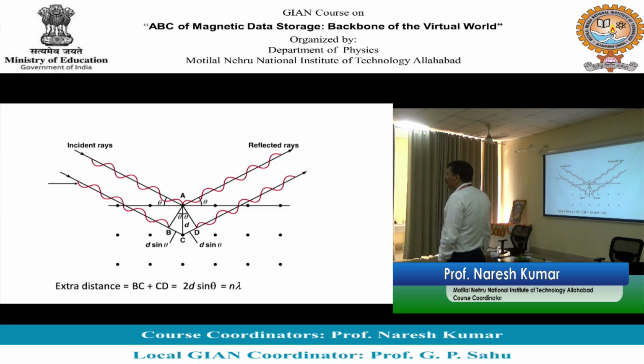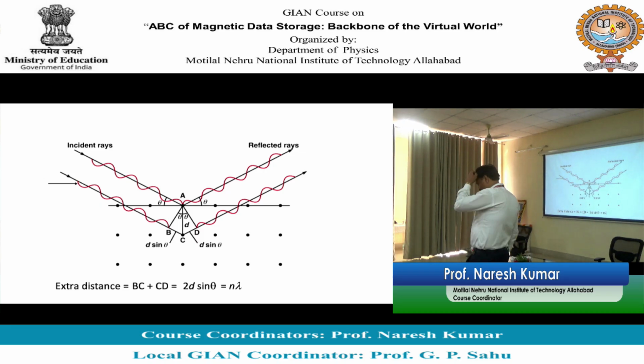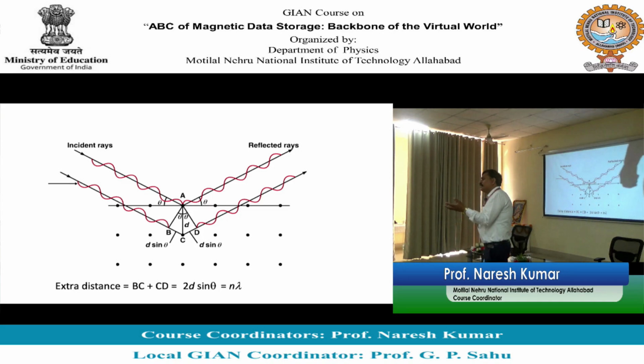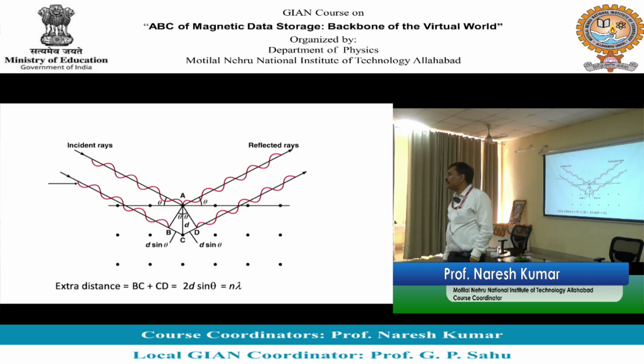Second, are they in the same plane? हम ड्रॉ कर पा रहे हैं, they are in same plane, और हो गया. तो why I cannot say it X-ray reflection, why I am calling it X-ray diffraction? मैंने शुरू में शुरुआत किया था, I started with Snell's law, कुछ उस तरह से बात करूंगा. हाँ जी, can I say X-ray reflection? मैंने बताया, सवाल इंटरव्यू में बहुत पूछते हैं.